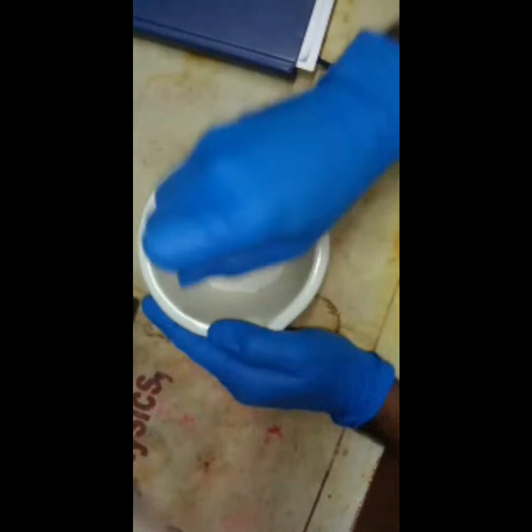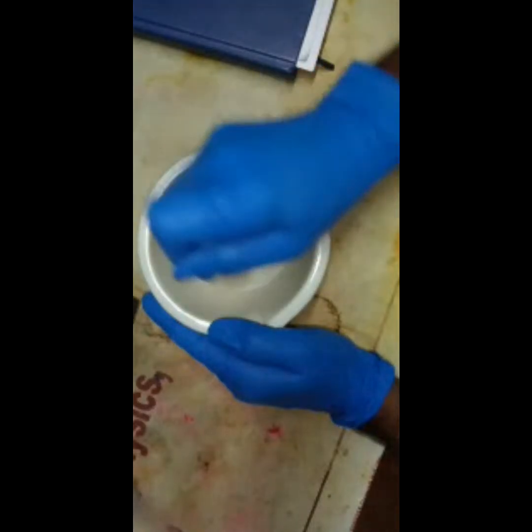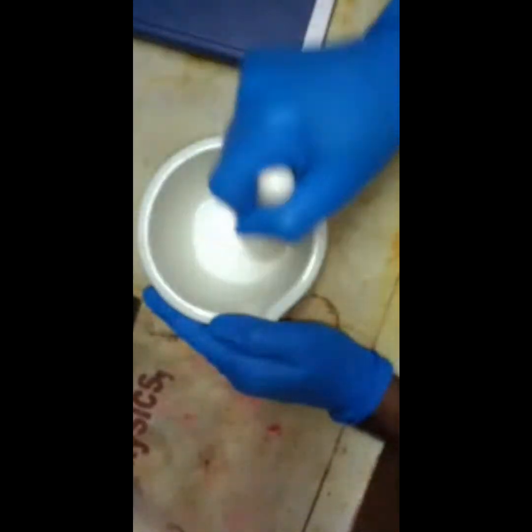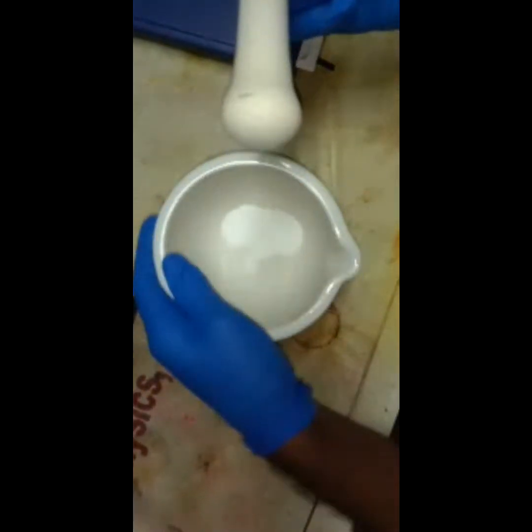So we are grinding the particles well. Now you can see clearly the particles synthesized in powder form.